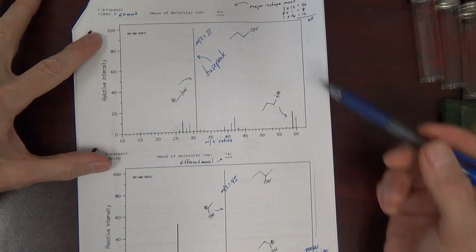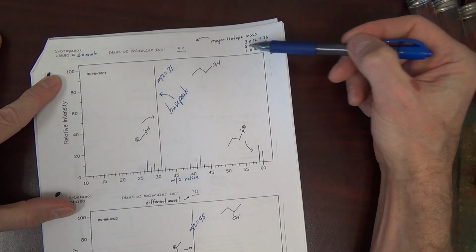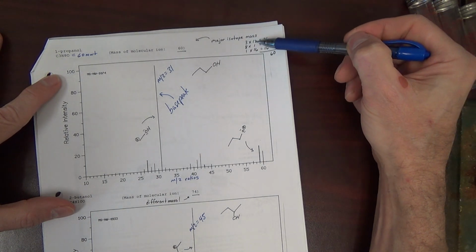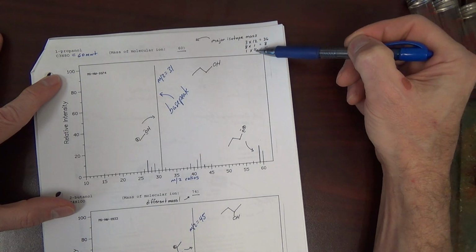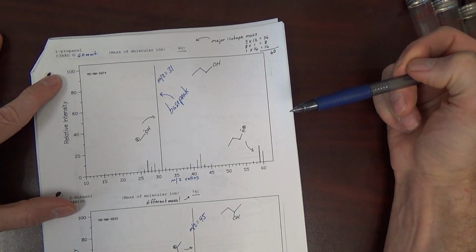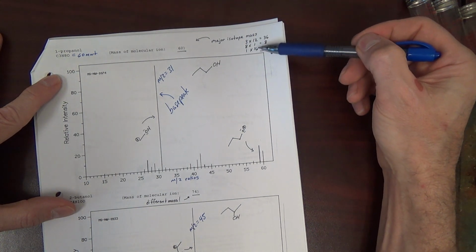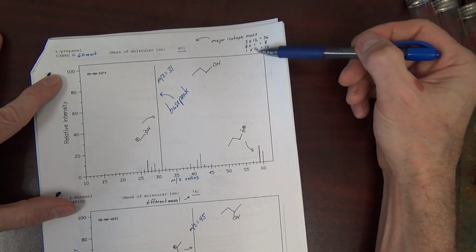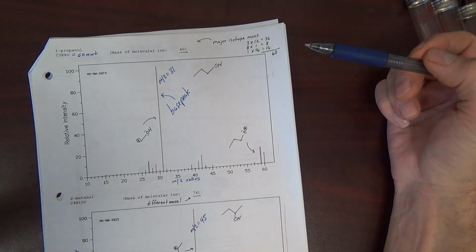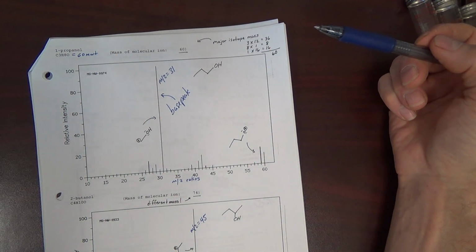Okay. Note that when we add up the molecular weights, nominal masses, whole number masses, carbon is 12, hydrogen is 1, oxygen is 16. Add these up and that's how we get our 60. We're using the major isotopes, carbon 12, hydrogen 1, oxygen 16. We will talk about when we want to consider the other isotopes.